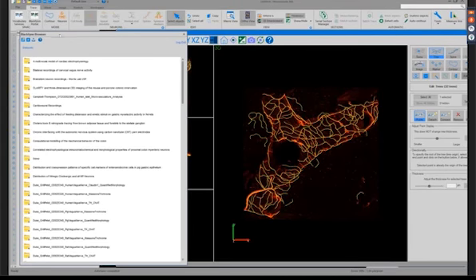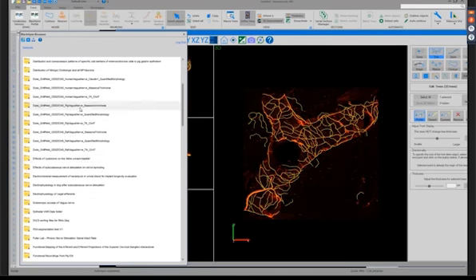When we select this icon, you would sign in with your Blackfynn credentials, and you can access all of the data sets that are available to you on Blackfynn. And you can go through these data sets, and the important thing is you can download and upload files directly to a data set through this connection.